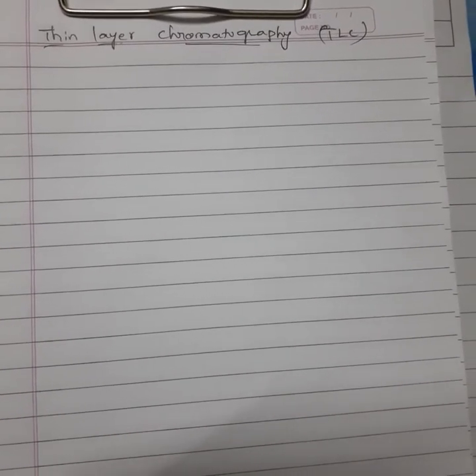Good morning to everyone. In the last class, we discussed column chromatography, which is our first chromatographic technique. And the next chromatographic technique is thin layer chromatography. Simply, we call it TLC.